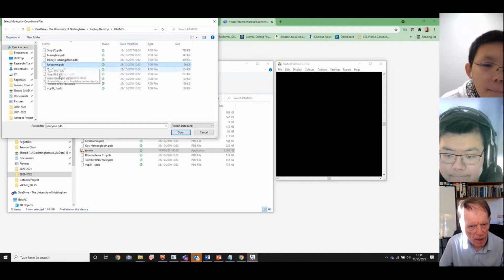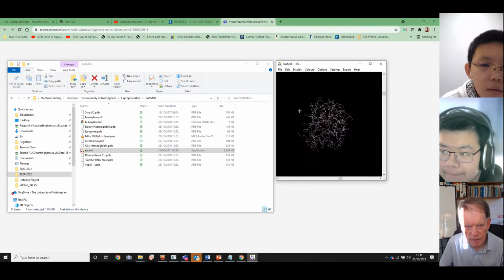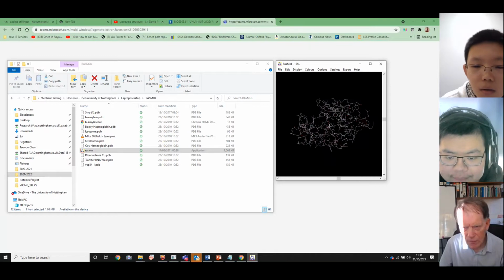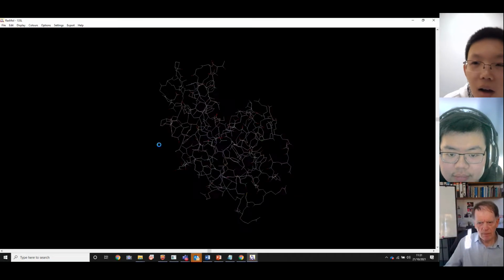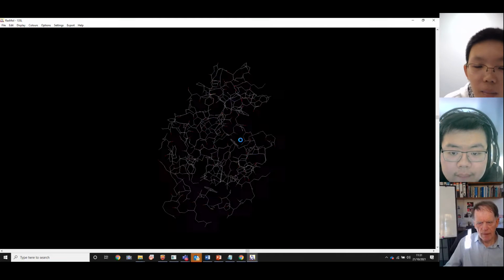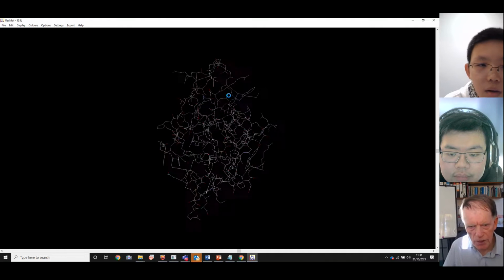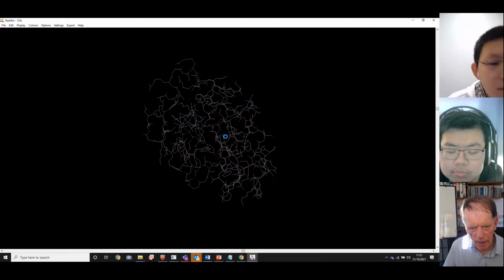Let's just click on Lysozyme and open that, and you can see, yeah, I've got it here. Okay, this is a wireframe model. But I actually can't see it on my computer. Can you see it? Okay. Let me try again. Don't use yours for the moment. Just don't try and copy. Just view what I'm doing now. Then you can do what you're doing later.